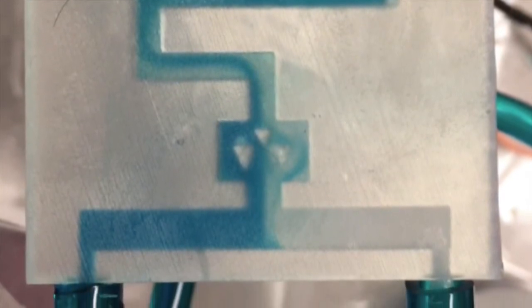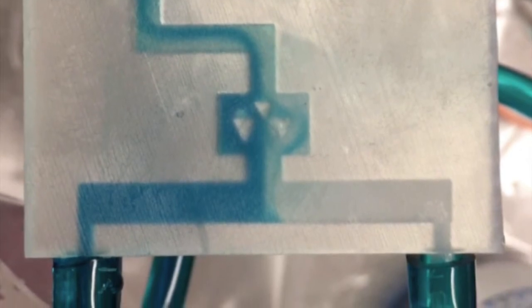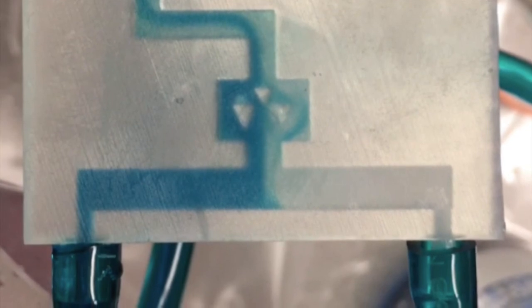The error bars for these experiments were constructed by taking 3 different trials run at the 3 different flow rates for each of the reactor types.